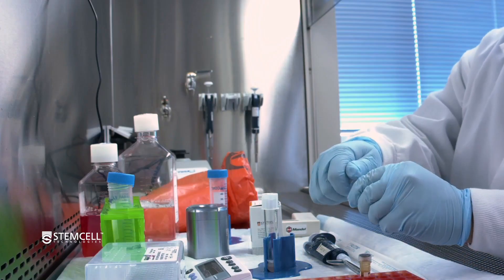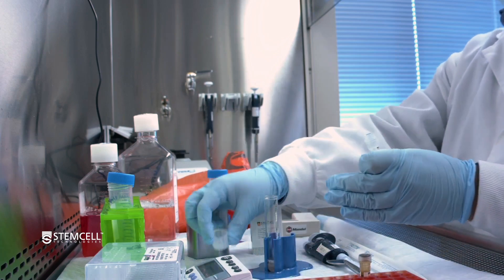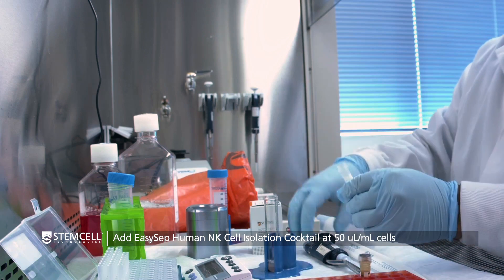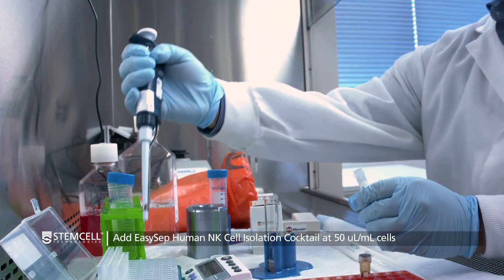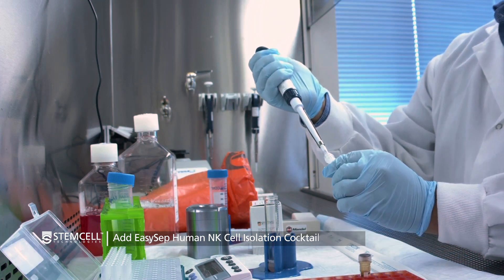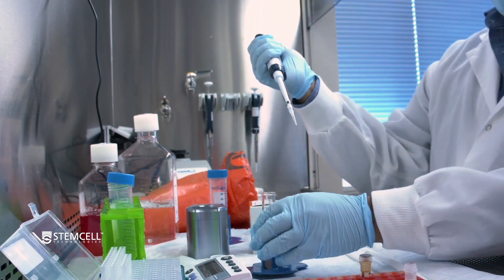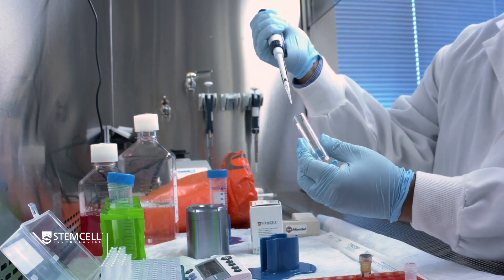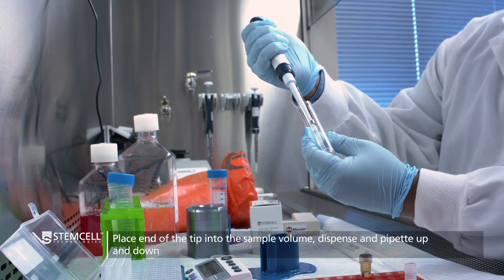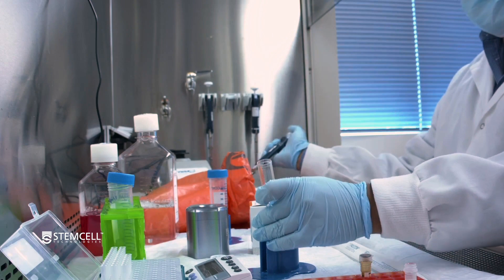Now start the isolation by adding the EasySep cocktail into the cells. The EasySep cocktail is prescribed to be added at 50 microliters per ml of cells. When adding reagents to the cells, ensure that the end of the tip goes into the sample volume, and then follow that up with a quick little mix to ensure that all the reagent is added into the cells.